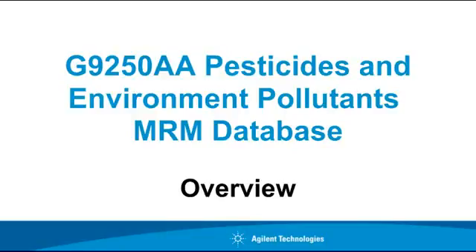This video provides an overview of the G9250AA Pesticides and Environmental Pollutants MRM database. It is highly recommended that you make a backup copy of the database.